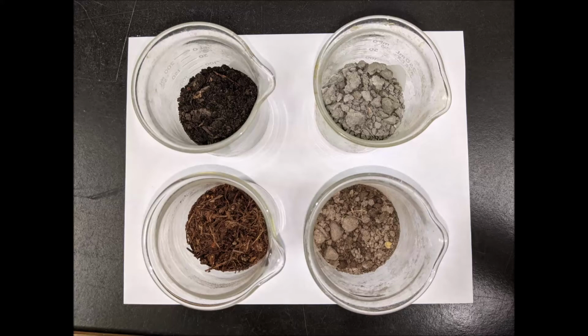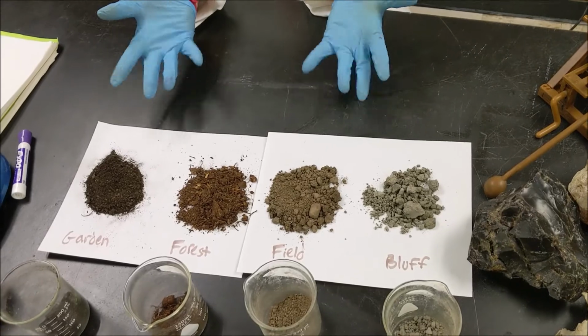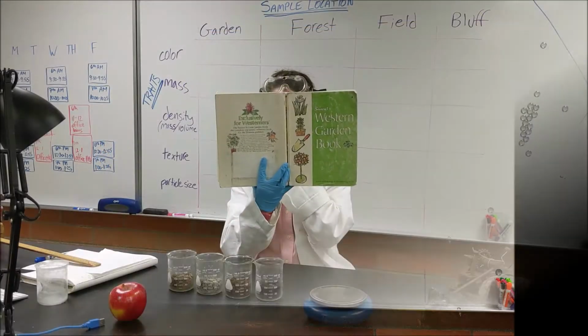Hey everyone, in our last video, we went on an epic adventure to go get our soil samples. Now, this time we are taking it to the lab for some pure, unadulterated science. Let's see what our samples hold.